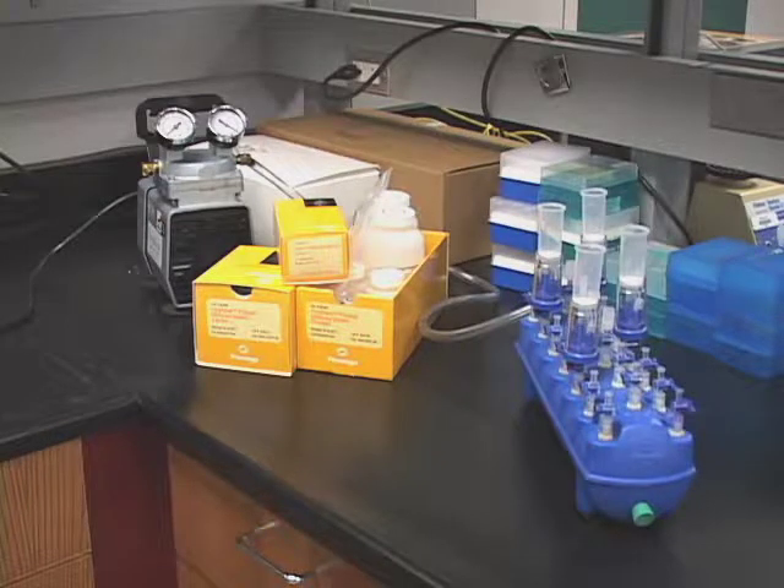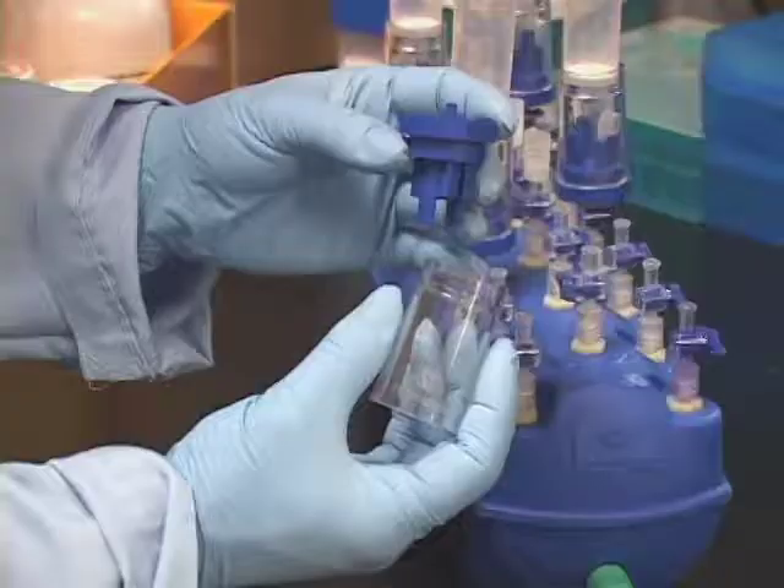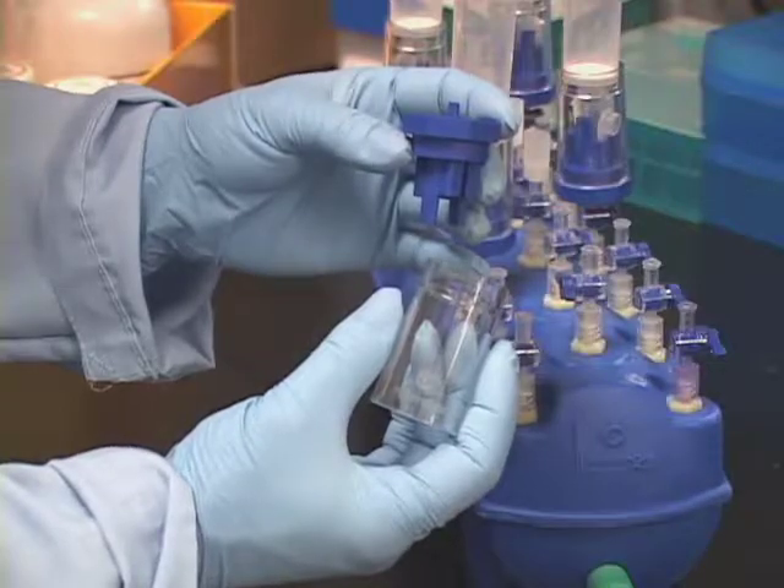The Eluator vacuum elution device is used with PureYield midi prep and maxi prep systems for elution of nucleic acid. The Eluator consists of two parts: a blue base and a clear barrel.